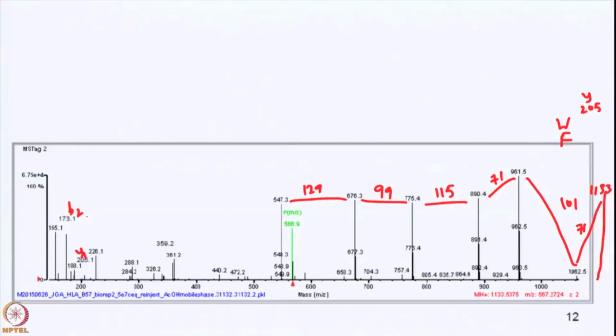So that's 30. So you want to call that 186, right? That would be another tryptophan. That would be 156. That would work. Okay, arginine, tryptophan, valine, D. Not enough information to get anything else.